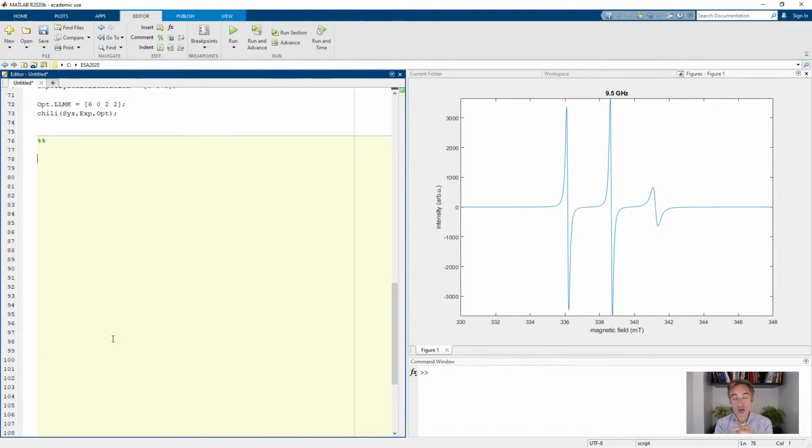Garlic, on the other hand, only works in the isotropic limit, but it also has capabilities for the fast motion range, where a spectrum consists of separate, distinct lines that look pretty Lorentzian, but they might have different line widths. If you're in this regime, this is called the fast motion regime. So you're moving fast relative to the spectral anisotropy, but not fast enough to completely average out everything.